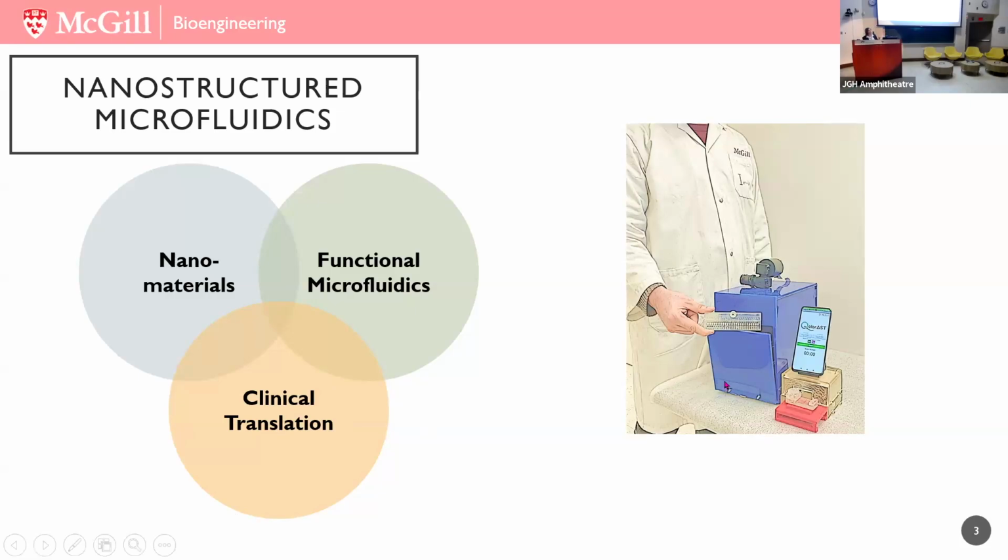And these are examples of devices that we develop that bring all these key elements of science and engineering into a benchtop tool. Of course, we publish, and we have patents, more than 7 or 8. We have started commercializing a couple of these technologies, handheld or even benchtop tools in the lab.